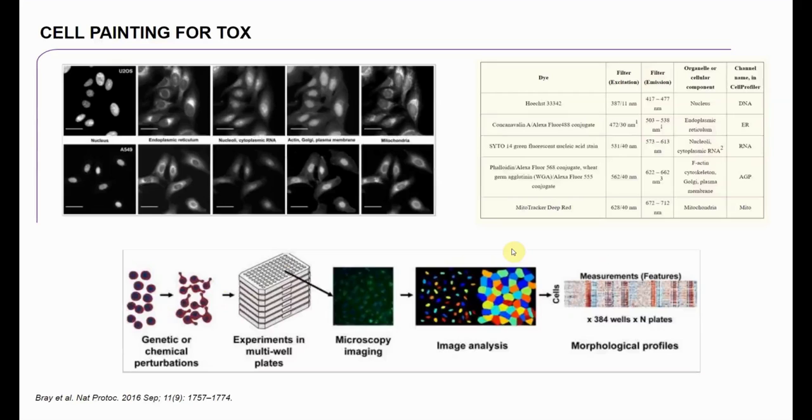They ran it through Cell Profiler, which is an open source image analysis platform that group had also developed. And this generates a lot of different features, lots of different texture features for all the different channels, as well as the usual intensities and things like this. And so then you end up with maybe 1,500 different features that give you a very rich data set from which to work with and to generate profiles.